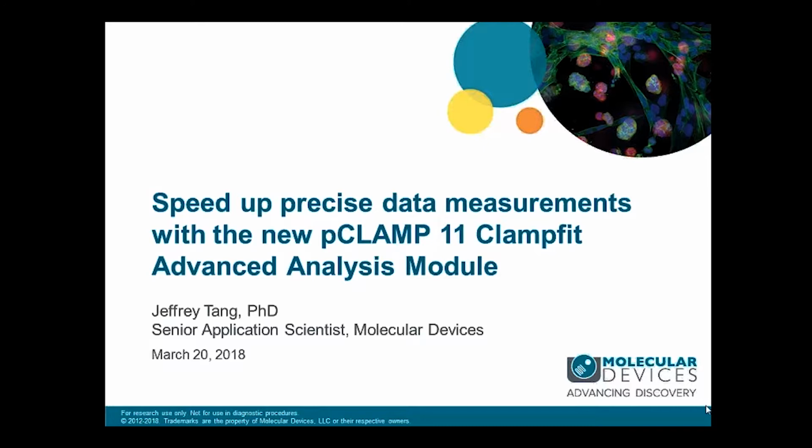So we launched pCLAMP 11 in November of last year. It took more than 10 years to launch pCLAMP 11. Although it is a small step from 10 to 11, I believe that this small step will bring a great benefit to all pCLAMP users. Now, let's get started and share the excitement. Today, I will talk about how to speed up precise data measurements using the new Clampfit 11 Advanced module.